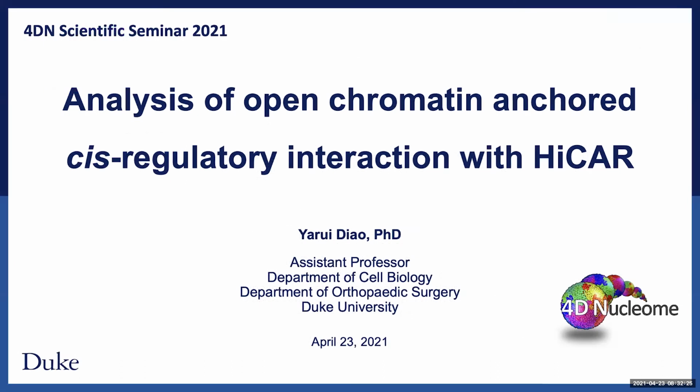Today I'm going to talk about a new method that we recently developed to capture the long-range chromatin interactions that are anchored on open chromatin regions. We are also working on the manuscript, so I would appreciate all the questions and feedback.